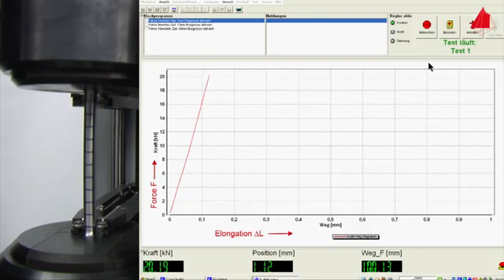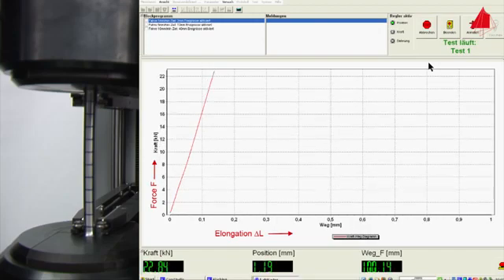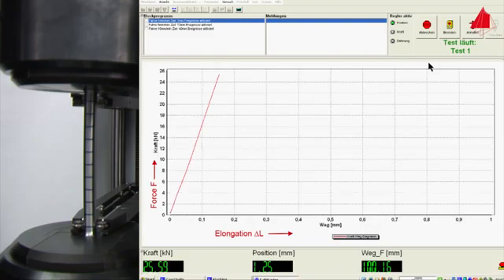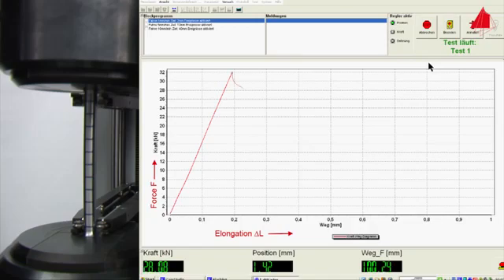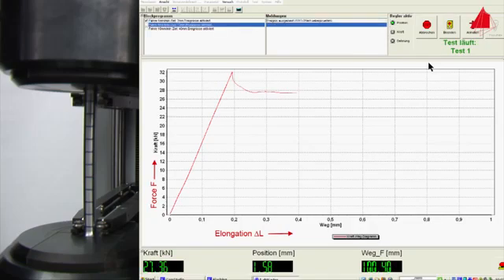In materials with yield point phenomenon, the end of the elastic area can be seen clearly. The plastic deformation starts abruptly and is accompanied by a sudden drop of force. If the test piece were to be unloaded now, it would not spring back to the original length but instead show a permanent elongation.